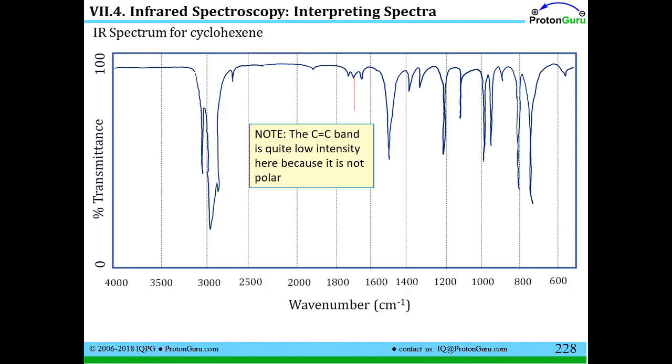The next spectrum I show you is for cyclohexene. So we have a cyclic structure with an alkene, and we would expect to see again our CH stretches for a typical alkane, but we also have H's attached to the C=C double bond. And that H–C bond requires a little bit more energy to stretch. So that's the peak right here. That's specifically the CH stretch for that sp2 hybridized carbon attached to the hydrogen.